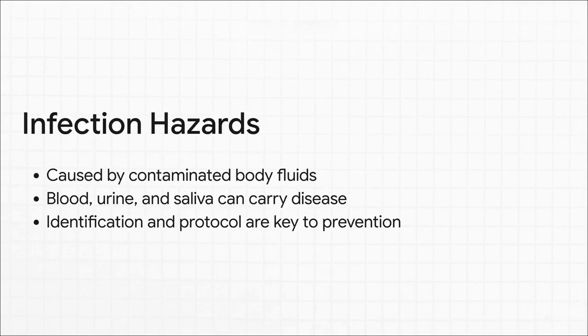And finally, we have to talk about infection hazards. In a biochemistry lab, you're often working with patient samples, things like blood, saliva, urine, and all of these can carry microscopic, disease-causing organisms. The danger here is literally invisible, which is why following those strict protocols isn't just a suggestion, it is your only real defense.